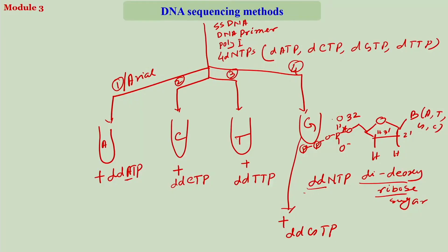So basically we do labeling to track somebody or something. Here also, the radioactive labeling was done with P32 to track the molecule. So all of these now have a star with P32, and here P32.